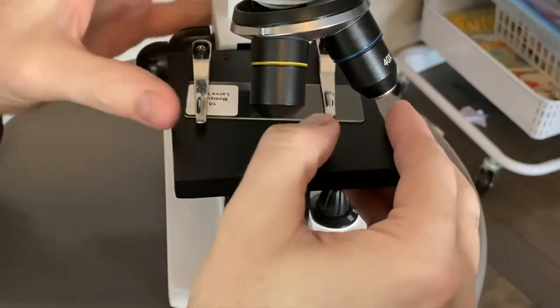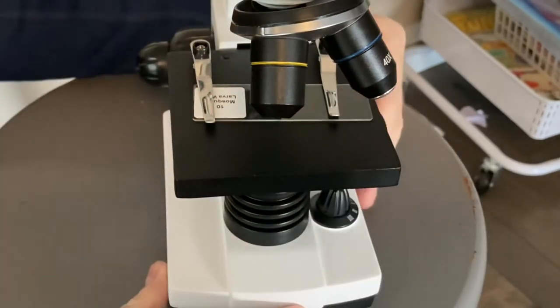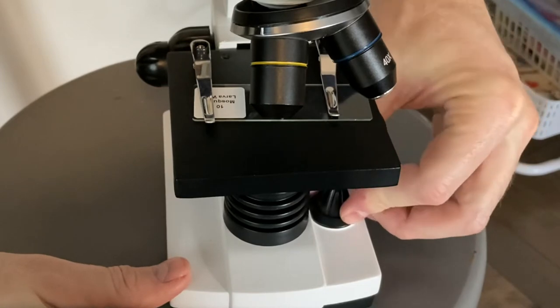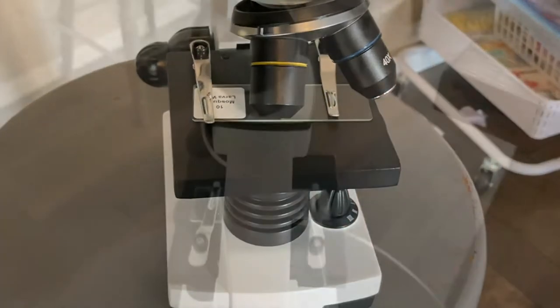For now we'll take a sample slide — this looks like mosquito larvae or something like that. We'll also look at blood samples and a bumblebee wing, so you can get an appreciation for the detail that the lens and this microscope can provide, both looking through the eyepiece and through the phone camera.